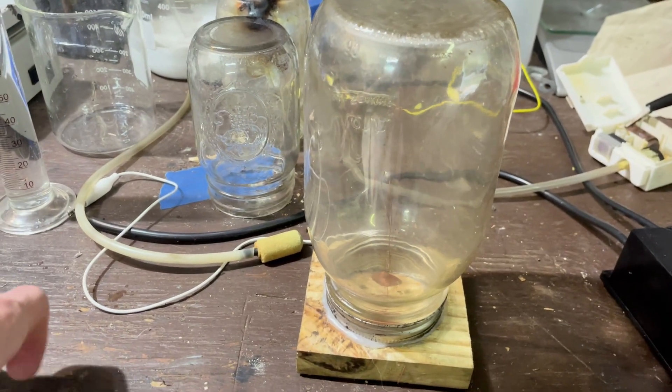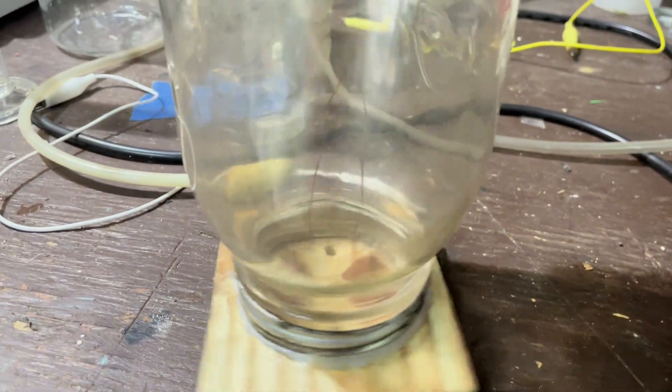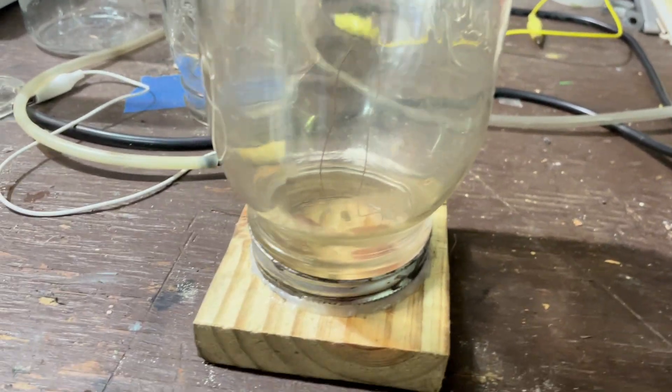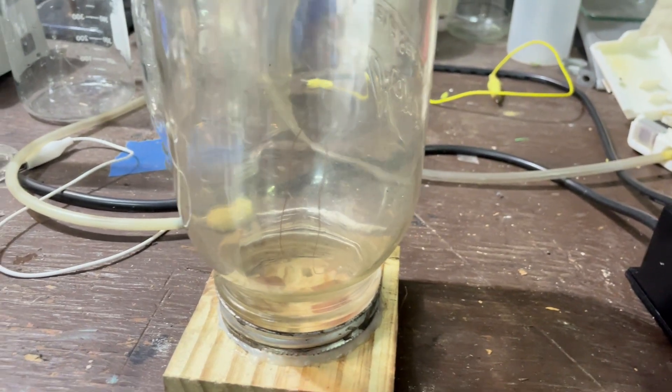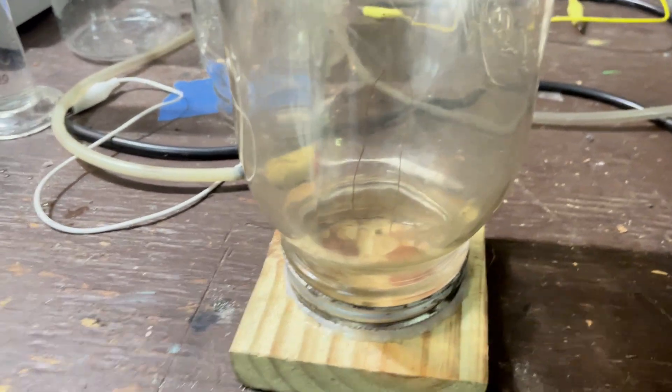Before I get everything set up, I should probably go through what this is and how it works. I think I'm pronouncing this right, but it's called a Birkeland generator. They used it to make nitric acid a lot before they got their new process — I forgot what it's called, but they used platinum for it.